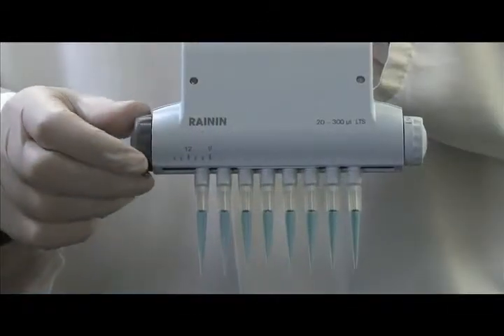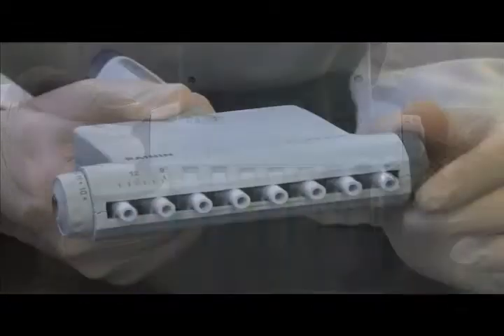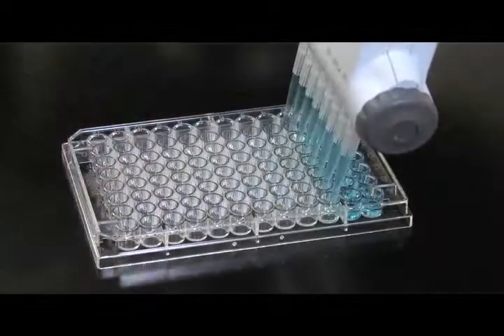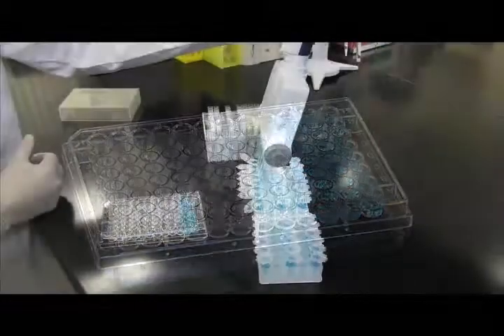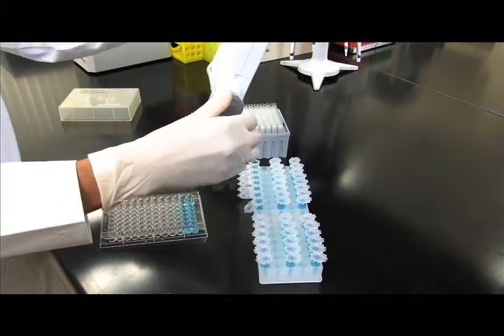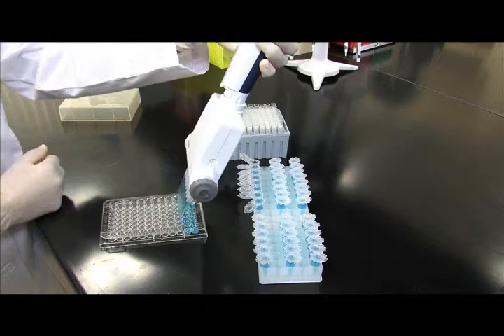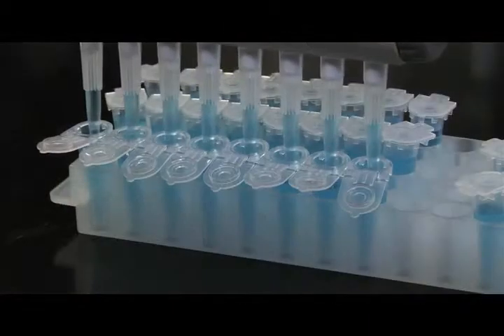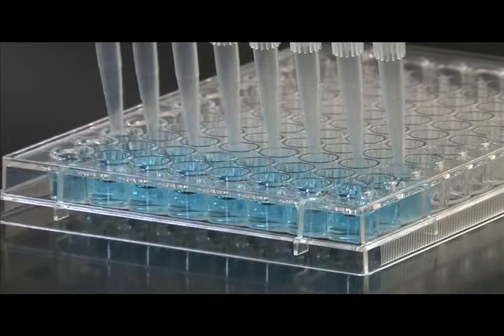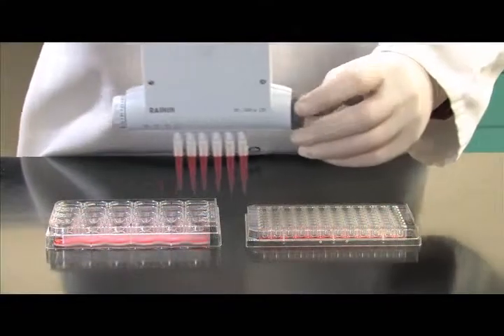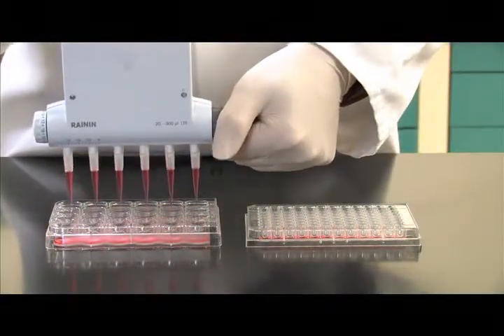The convenient millimeter scale and guide assure fast format changes that are accurate and repeatable. Its smooth variable spacing lets you quickly move samples between different formats. For example, from micro-centrifuge tubes to 96-well plates or between 96-well plates and 24-well plates.